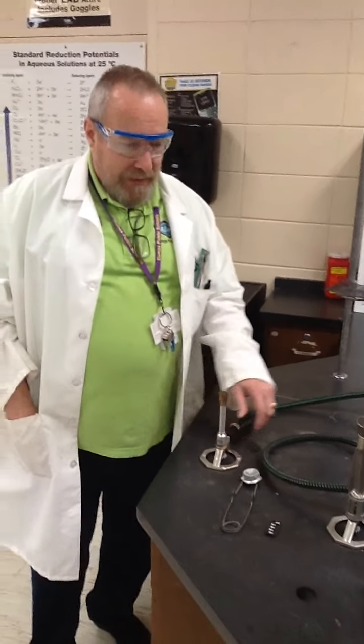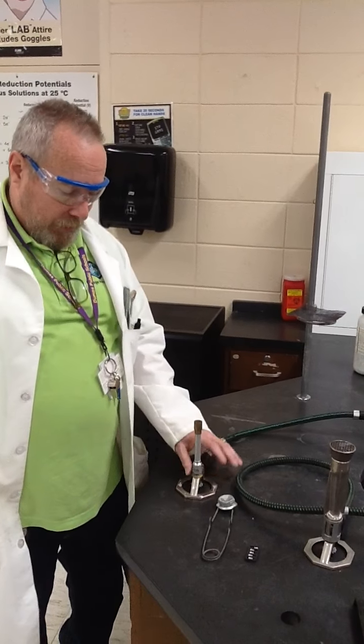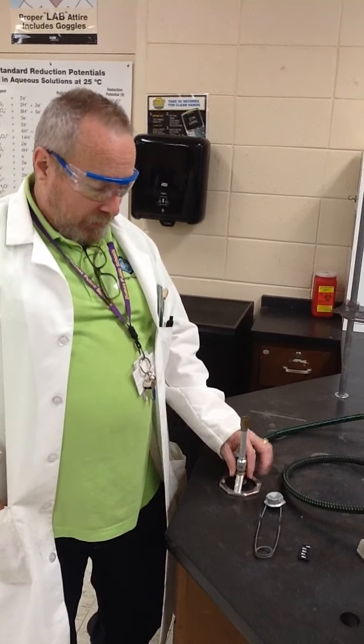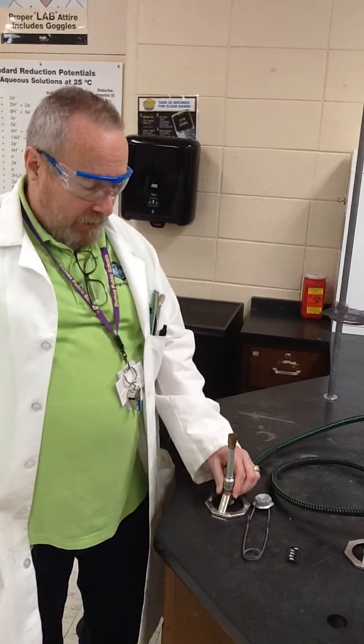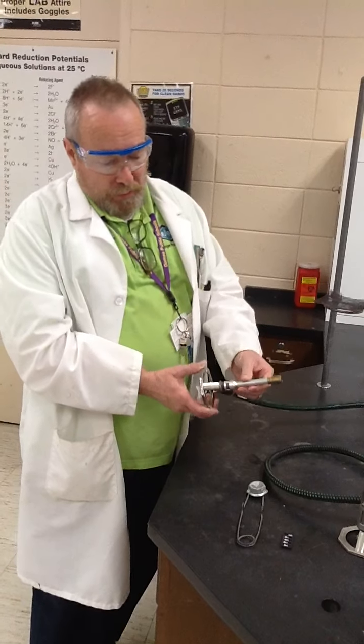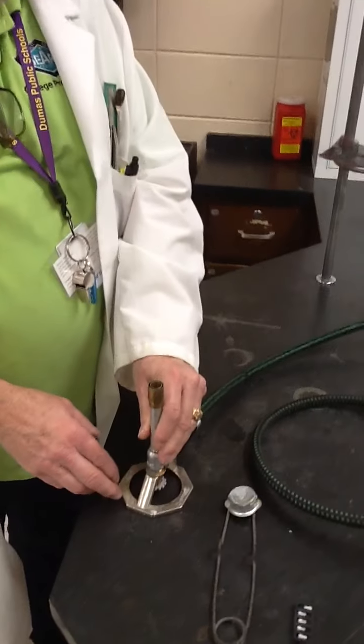Well, let's have a little more instruction just as a way of experimenting with our burners. So, there are many types of burners. This is a Bunsen burner. This is technically a Tirrill burner, but it is very similar to a Bunsen burner except that it is adjustable. The flame is adjustable with a screw at the bottom, and the air mixture, the fuel-air mixture, is adjustable by opening and closing this gate at the bottom by screwing the chimney up and down on it.